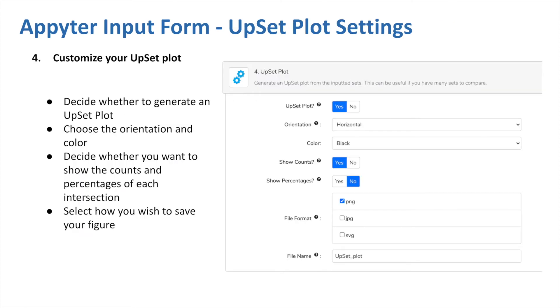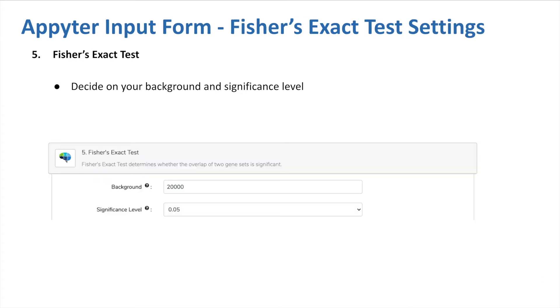Similarly, the user can choose whether they want an upset plot, and if they do, they can customize the orientation and color of the figure, decide whether they want the cardinalities or percentages to appear in the figure, and choose how to save their figure. Finally, the user adds information needed to compute Fisher's Exact Test. This includes the number of background genes and their desired significance level. For humans, we typically use a background of 20,000 genes, which is the default in the Aperture.